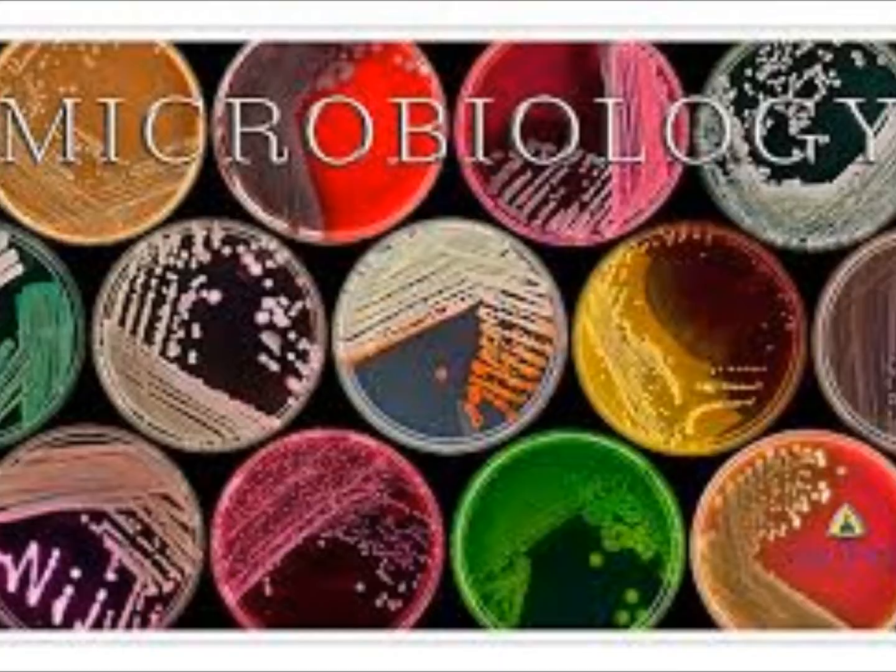Does it matter which plate? Yes. Which plate are we always going to use? We use the blood plate because it doesn't have any inhibitors. If you use the CNA plate, it's got antibiotics in there that are inhibitors, and it can change the cell wall of the organism. And we don't want to change the cell wall, because the cell wall is what gives that organism the ability to retain the crystal violet. So we don't want to compromise the cell wall, so you always use a blood plate.